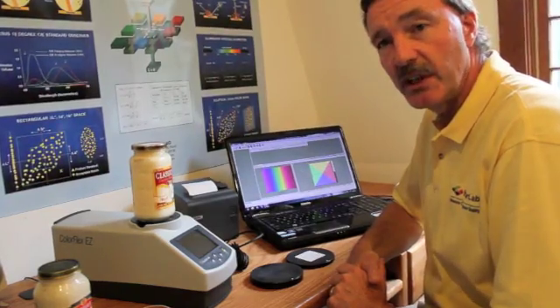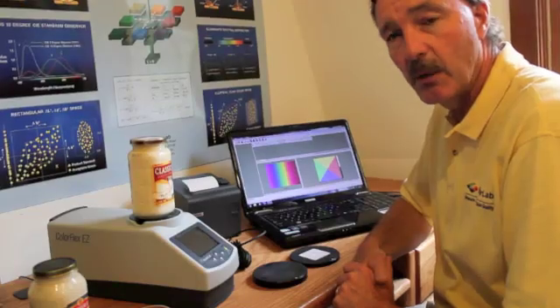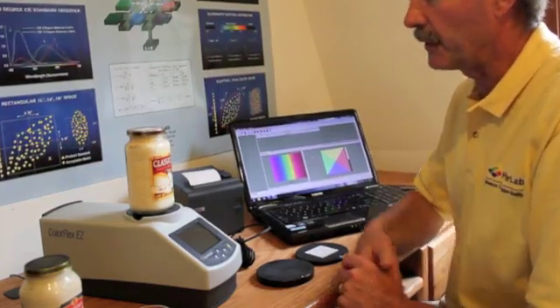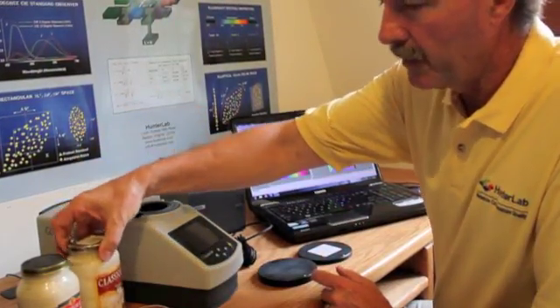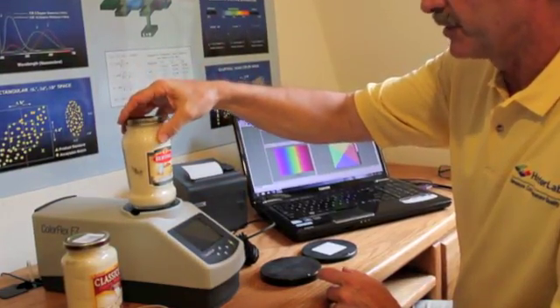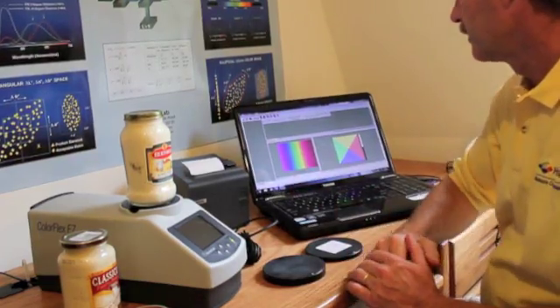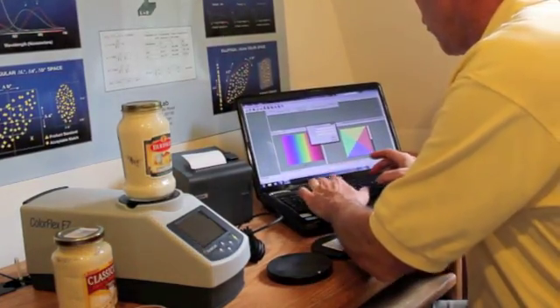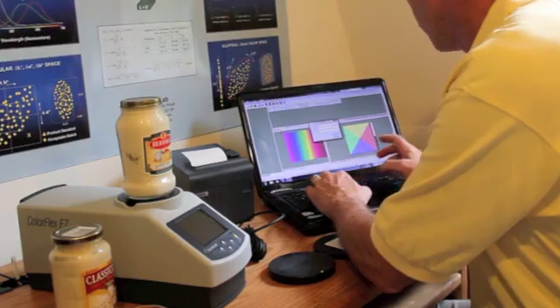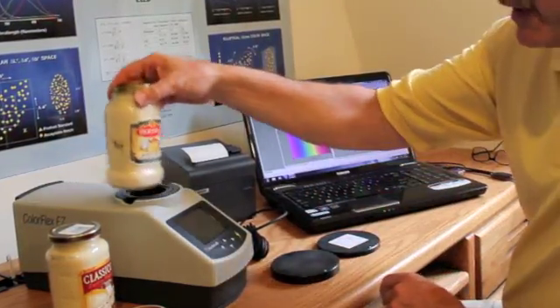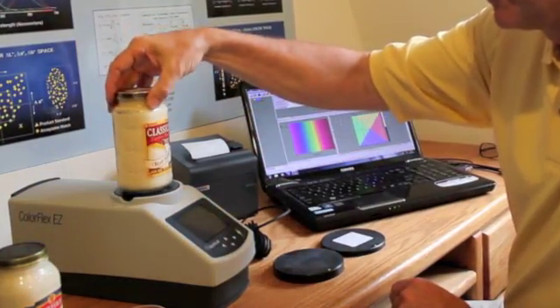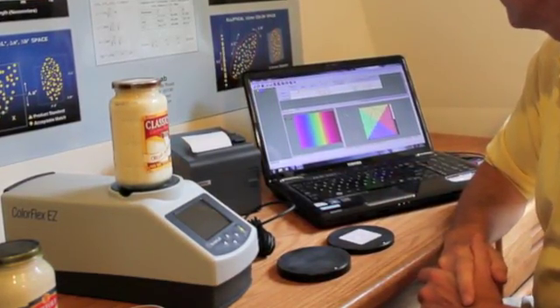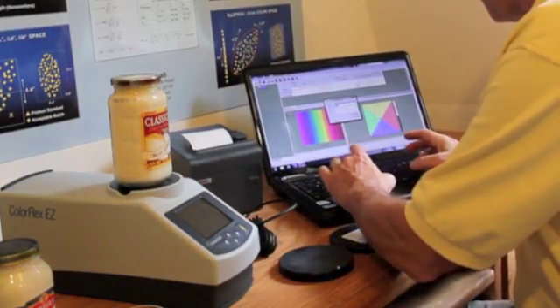Some people in production settings use the instrument just as a standalone system. However, we can all produce additional reports using our EasyMatch QC software. Here, I'll go back and measure our first product, our Bertolli sauce, and call that our standard. It takes about 3 seconds to take a measurement, and I'll type in product identifier. Now I'll compare that against the Classico sauce. And this will be our sample. And I'll type in the name Classico.